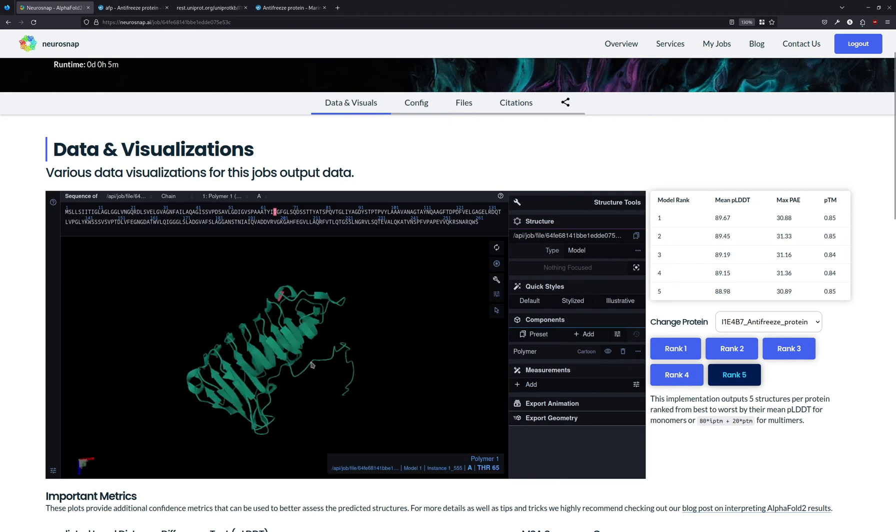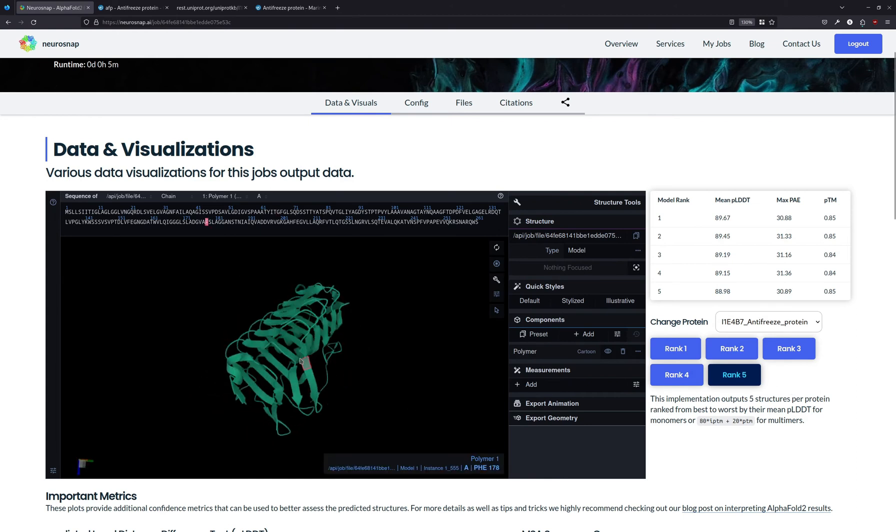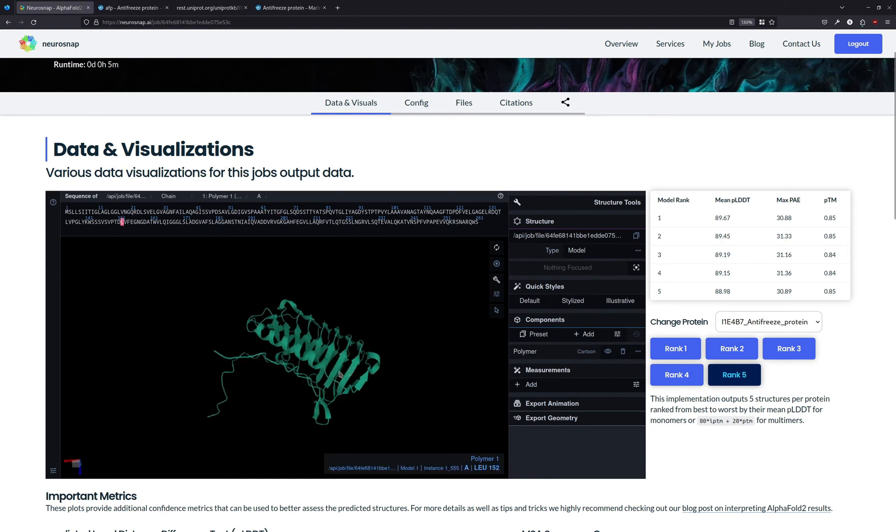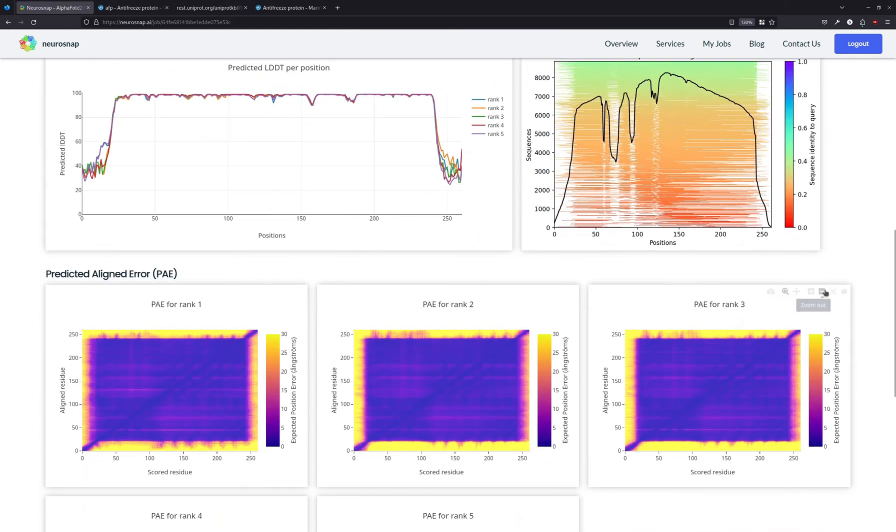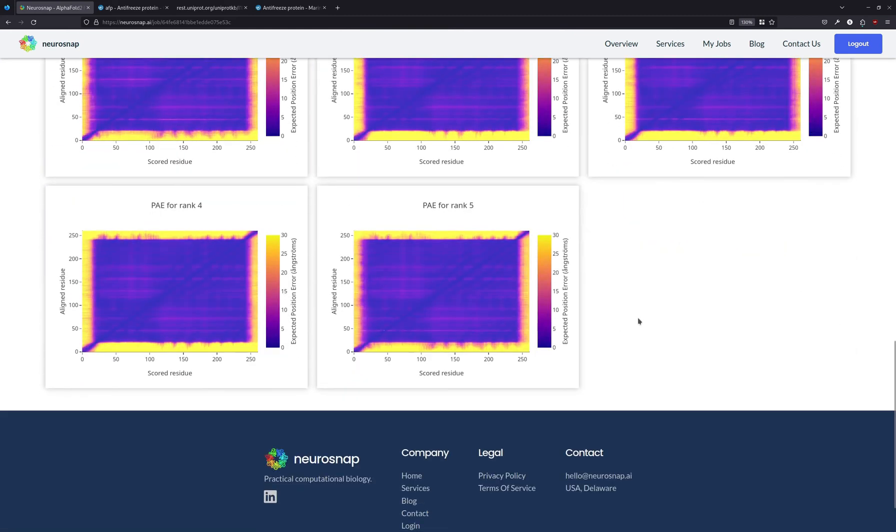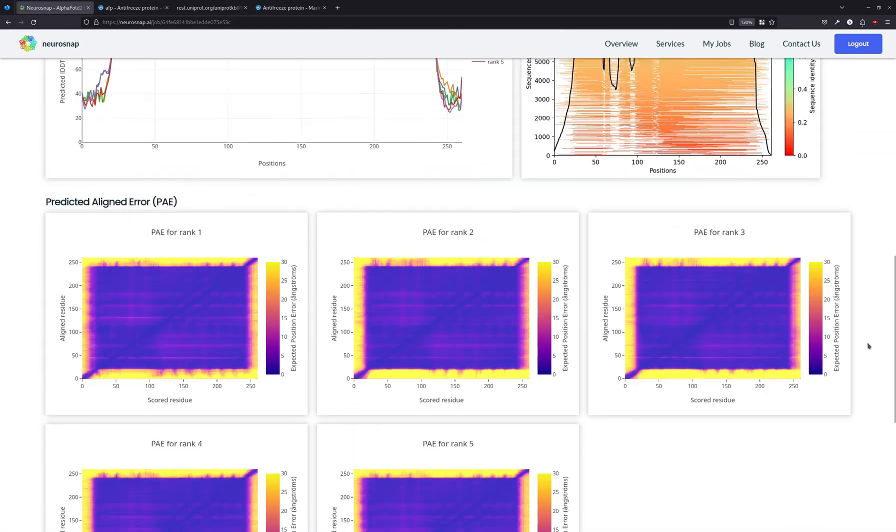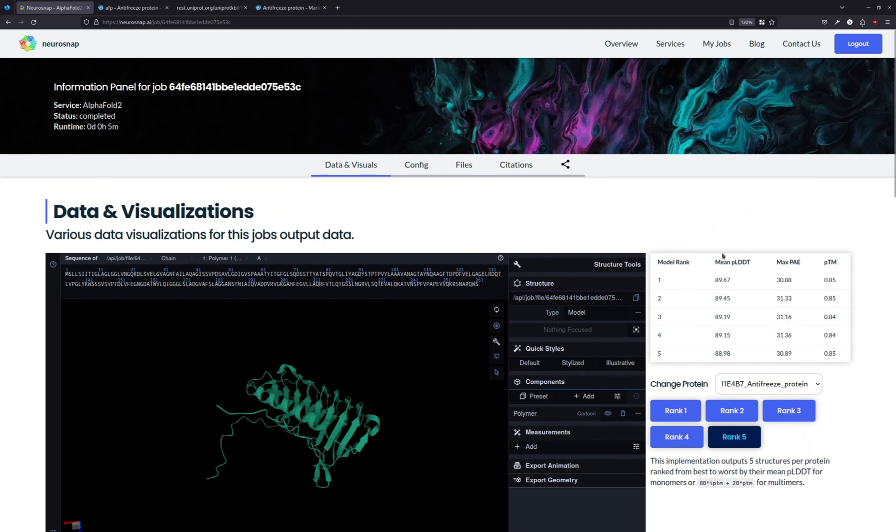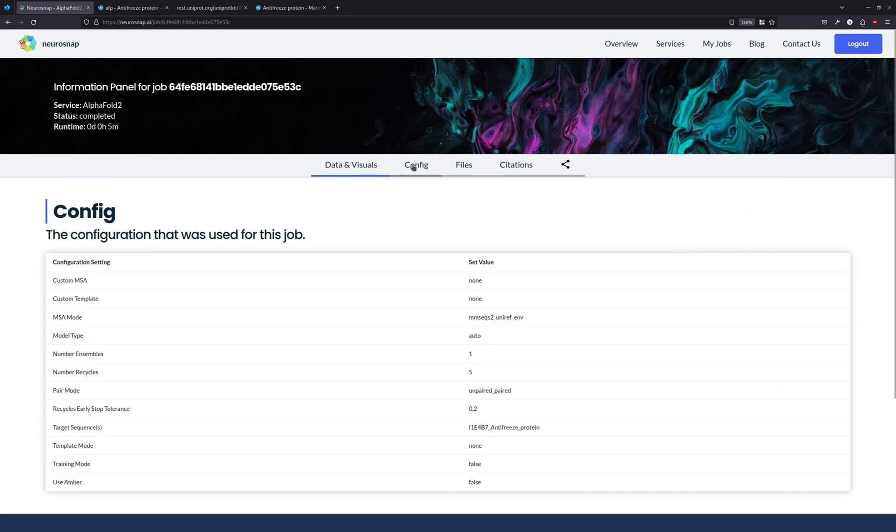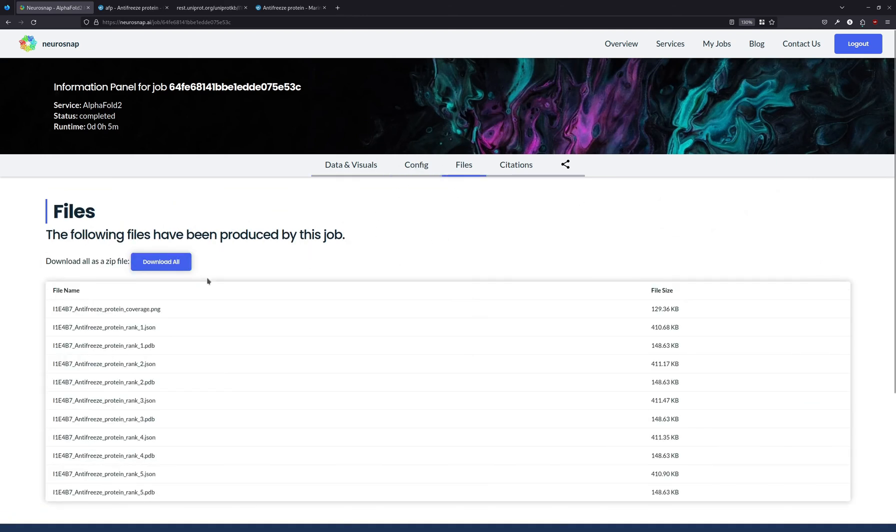We also have a couple other metrics that Neurosnap provides that are taken from AlphaFold 2. If you want to see the configuration for the job, you can do that here. If you want to download the files, everything is available over here.